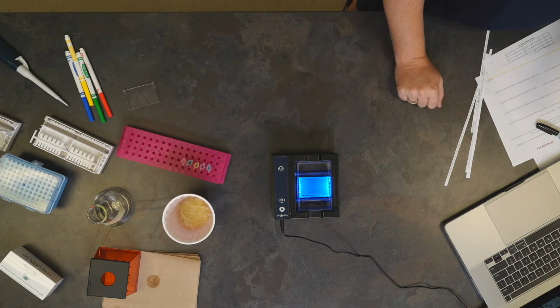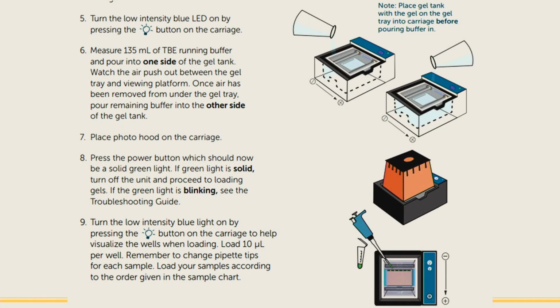So take a look at the image that you see on the screen here. Now that everything is in the gel, all we have to do is add our samples into the wells. This process is going to involve your students micropipetting DNA samples into those teeny tiny wells that we just made. Sometimes this can be difficult for students. Make sure that if you haven't already done so, practice using our pipetting lessons before.